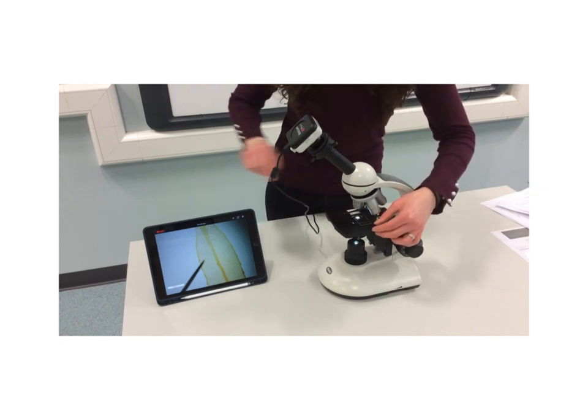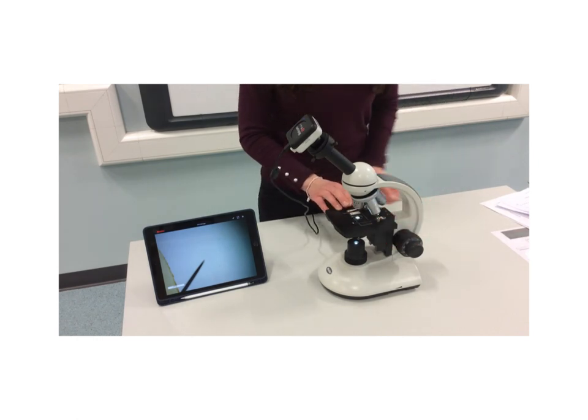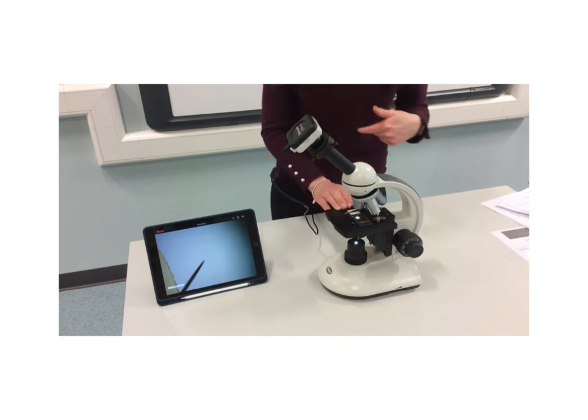First of all, I'm going to move the slide to the right. Have a look at the iPad screen at what happens. Which direction is it moving? I'm moving it gradually to the right. What direction did it move? Hopefully you saw that it moved to the left. Could you write that into your booklet? That when we move the slide to the right, the image moves to the left. Let's try it the opposite way.